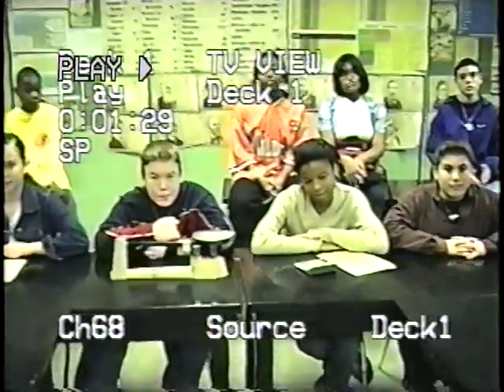Okay, we are here for video lab number 8 today. We're meeting today's team. Davey. Frankie. Takia. Big Phil. Big Phil, with an F. Phil with an F. Okay, as opposed to empty. Phil, empty. Okay. All right, who can tell us what the lab is all about today? What are we trying to do today?